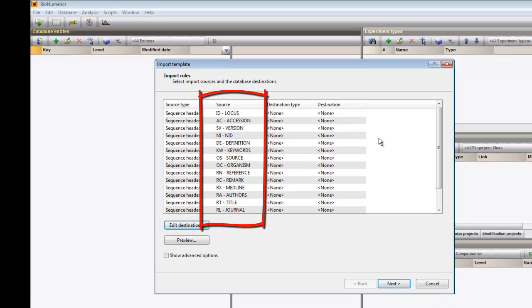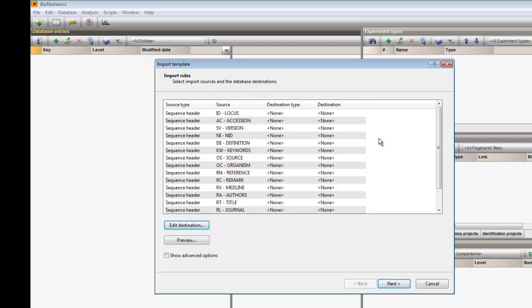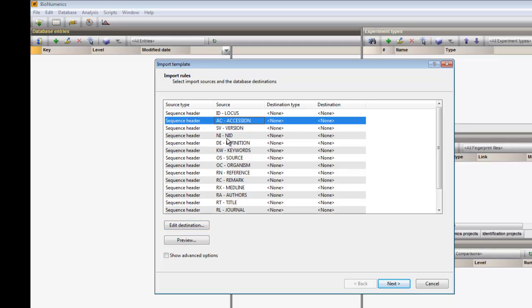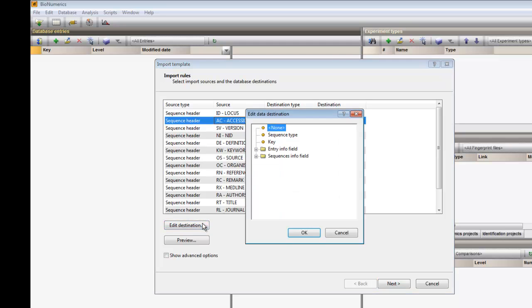The header fields found in the text file are listed under the column Source. We would like to use the accession number as a key field in Bionumerics. I therefore click on Accession and next on Edit Destination. Here I select the key field and click OK.